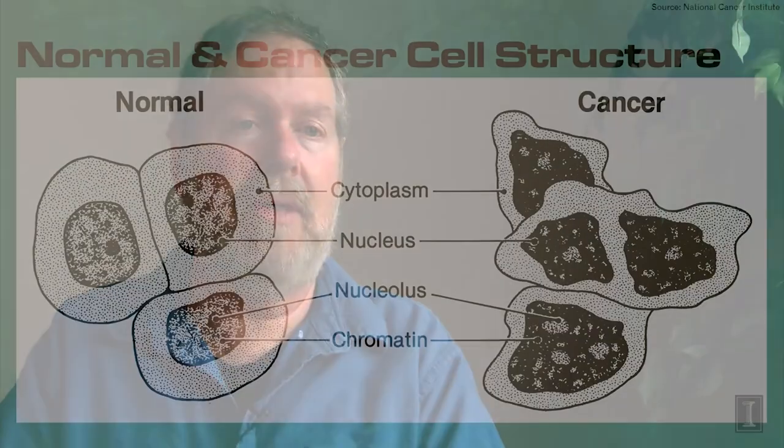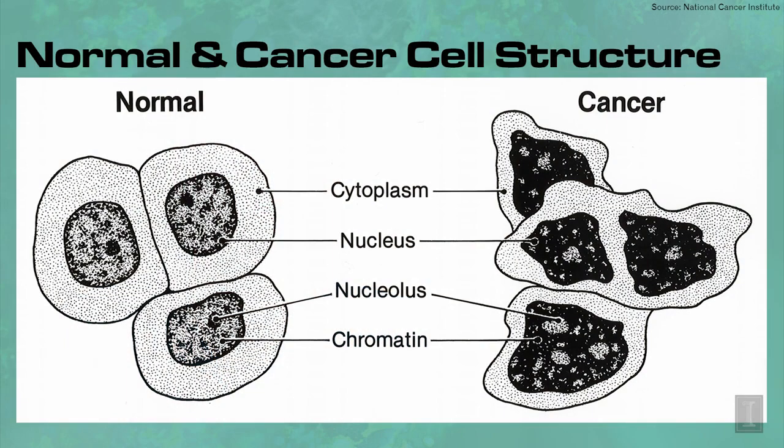We do have collaborations with researchers at the local hospital, Carle Hospital, in the oncology department, looking at tumor cells and circulating tumor cells on an individual cell basis, looking for biomarkers that may give hints at what types of cells may metastasize. We have collaborations with other researchers in many other different universities, both through collaborative grants and just people sending samples to process here.